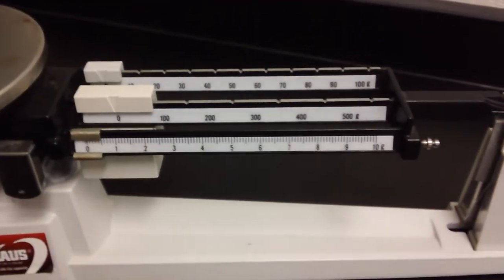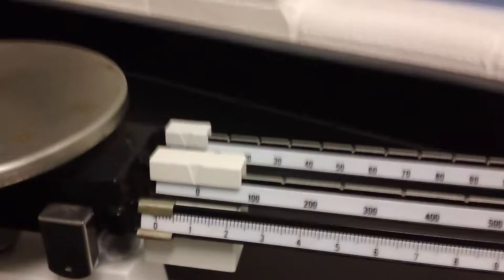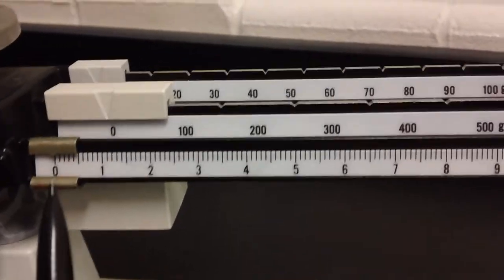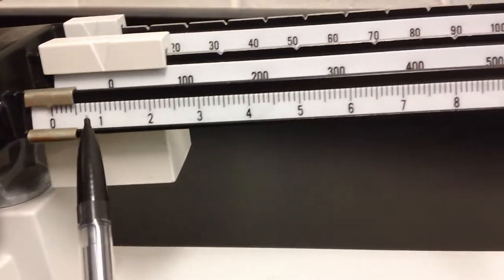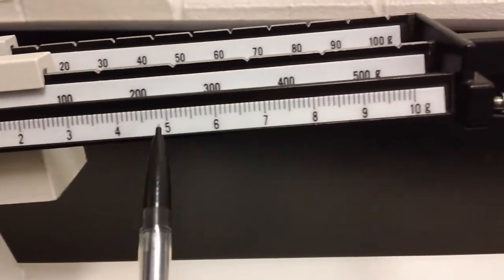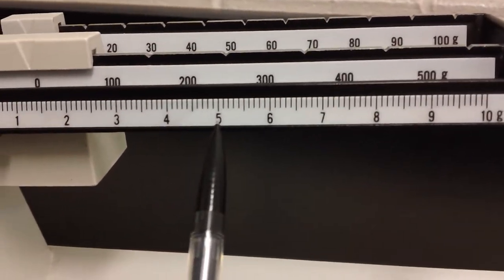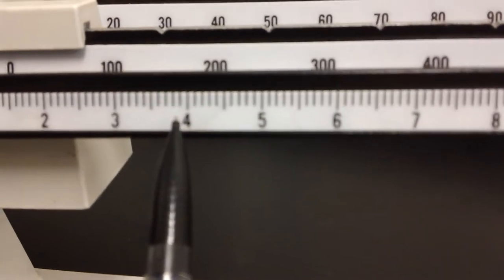All right, let's take a look at the three arms on our triple beam balance. The front arm is broken down into single grams. So everything you see here, one, two, three, four, five, these represent single grams, and these are actually broken down into tenths of grams.